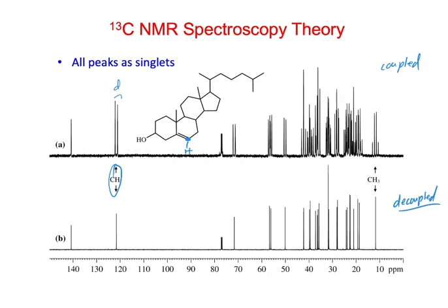This one over here is just a singlet. Right? And it's still a singlet, and that is this carbon here. Right? It has no protons attached.